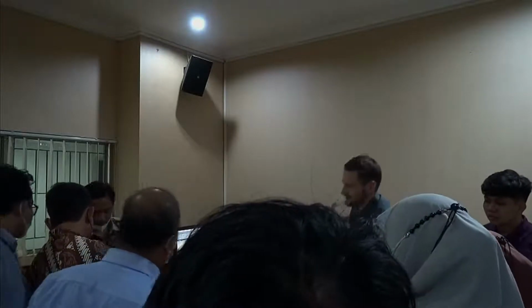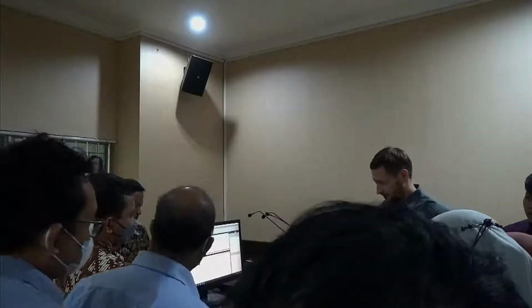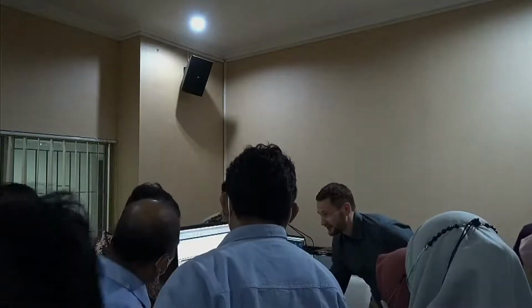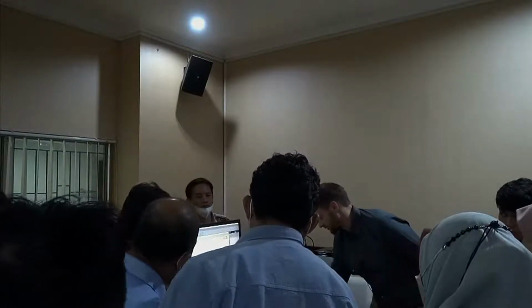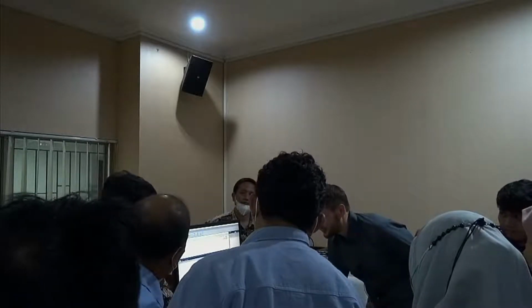So about time to check our result. So that is the result of our F500. The first thing we want to know, and that's why we do 3 consecutive measurements, we want to know if our dispersion is stable. I'm pretty sure it is. As you see, we see only one chart, and the reason is they actually cover up one another perfectly. So the repeatability of this material, no surprise. I mean, that's why we use it as a standard, because we know it disperses very, very well.